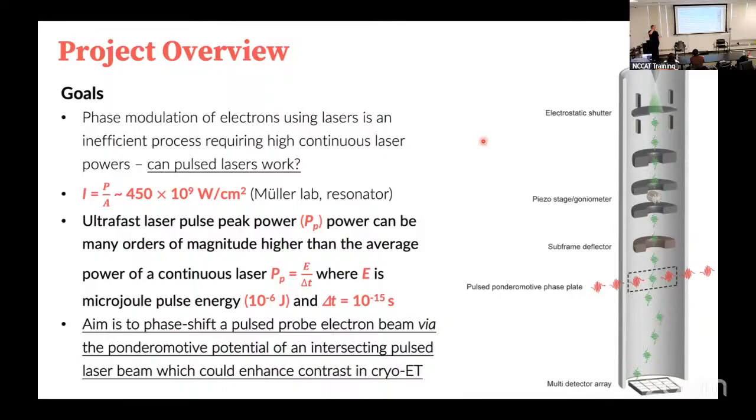So at the end of the microscope, when you go into the K3, you have this pinhole, right? The pinhole, you'll see later today, is really creating a kind of energy filter. So typically, empirically, people have found that 20 eV is the best slit width that you can have. People have tried smaller, people have tried wider. 20 seems to be the best in terms of getting that balance, as you say, between elastically scattered and inelastically scattered. So perfectly elastically scattered would be 0, right? So you're giving it a little bit of spread around the 0, and that gives you your best contrast for them. Does that make sense?